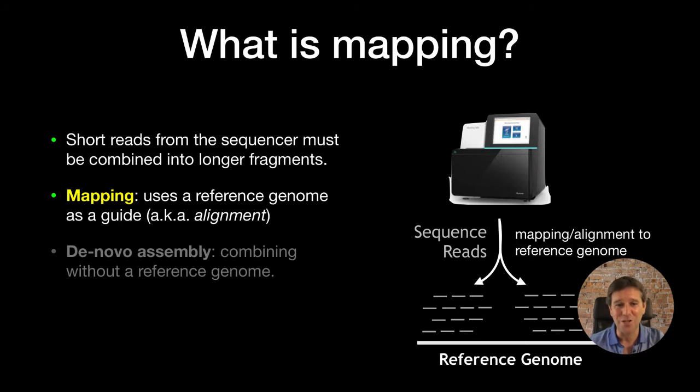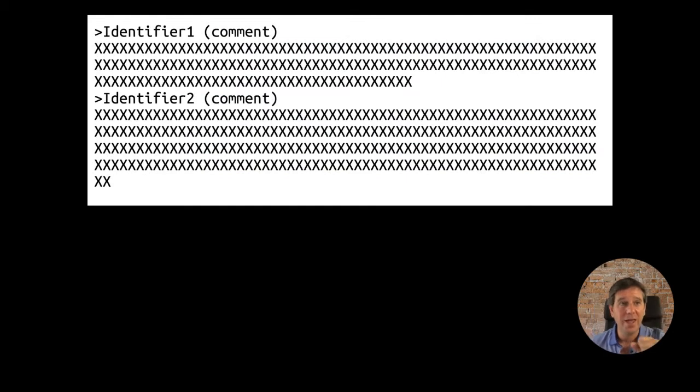We've got a reference human genome, so we're just going to map them by alignment to the human genome here. And so they typically come in FASTQ format. Now we saw in the past FASTA format, right? FASTA format, and this is the simplest sequence format around.